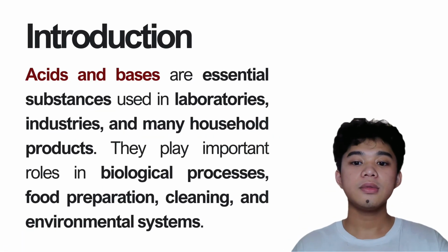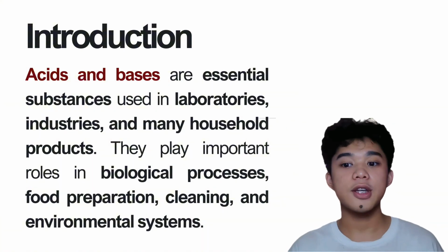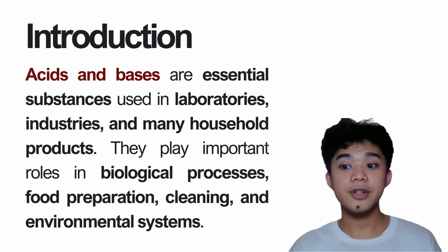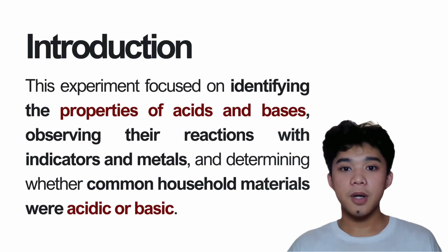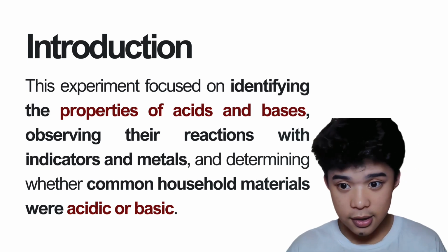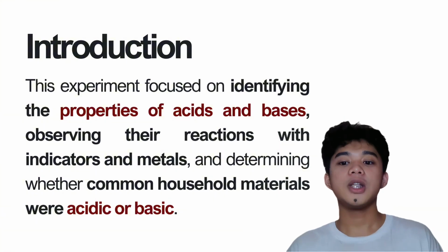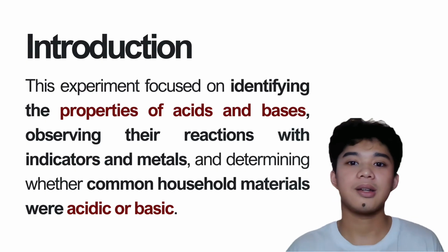For our introduction, acids and bases are essential substances used in laboratories, industries, and many household products. They play important roles in biological processes, food preparation, cleaning, and environmental systems. This experiment is focused on identifying the properties of acids, the properties of bases, and observing the reactions with indicators and metals and determining whether common household materials were basic or acidic.